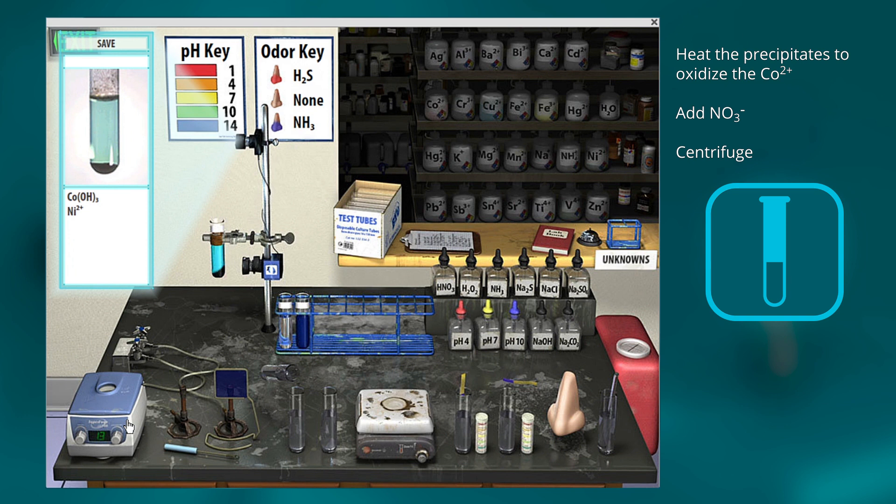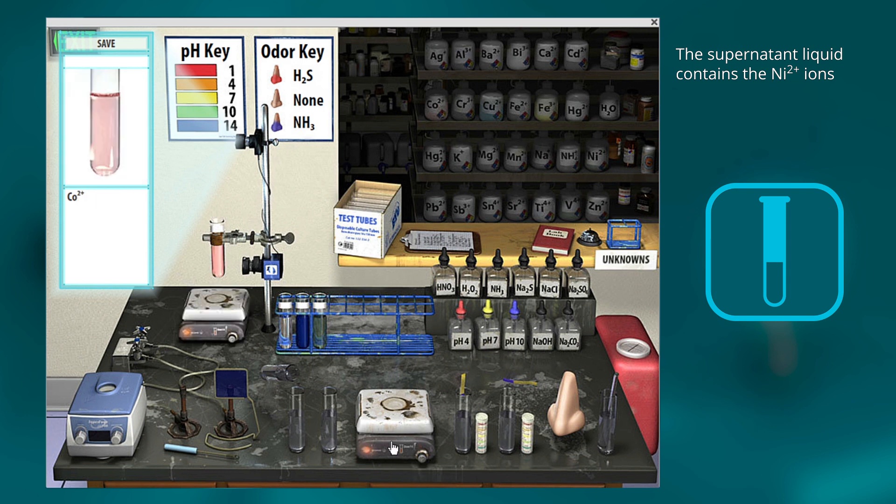So now when we centrifuge and decant, now we have our nickel separated off, and our cobalt is in here. It's still in the oxidized state, so if you want to take it back, you can add heat again, and that takes it to the original oxidation state that we started with.